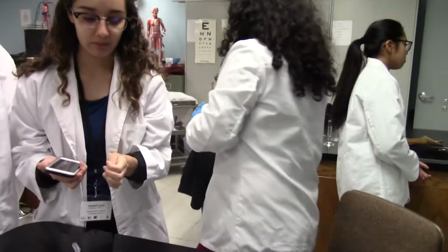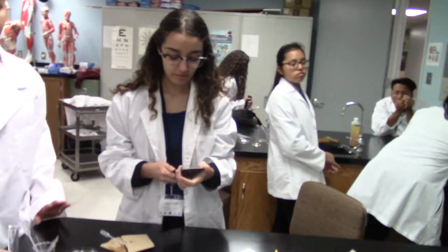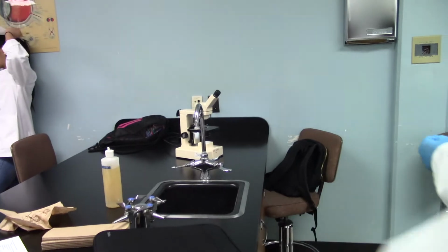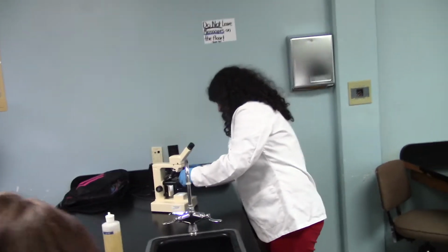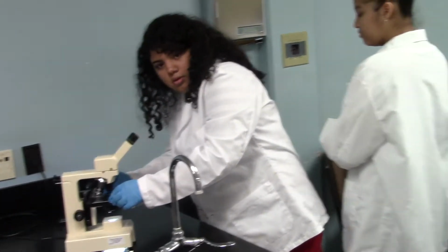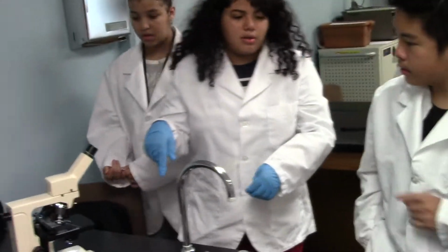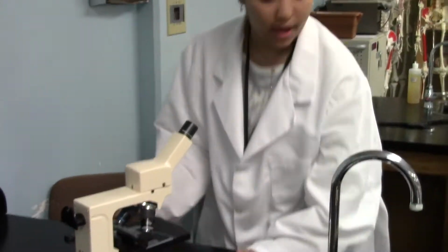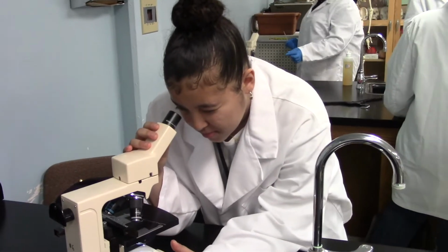Okay. Now you're ready to count again. And this time you time him for 1 minute and count how his pulse changed. Got it? And you're going to repeat that. It's just the longer you leave him in the sugar water, that's what increases. Otherwise, everything's exactly the same. You always time the pulse rate for 1 minute.